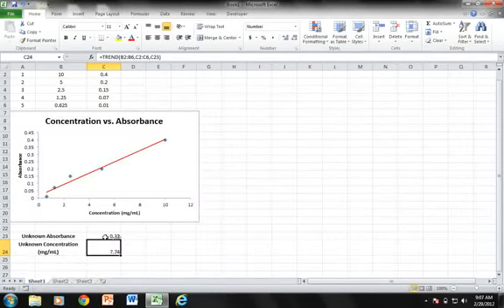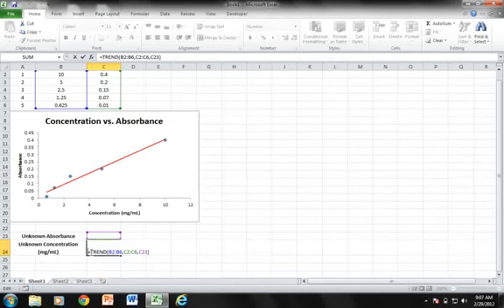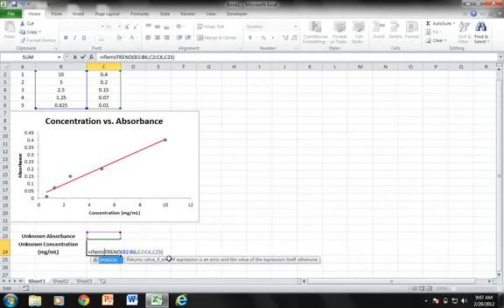Okay, so when I delete this, it gives me that value message, basically stating that there's a value missing, and that's an error. So to correct this and have it not display anything if I don't have anything inputted for my unknown, I'm going to type in a special formula called IFERROR. Basically what IFERROR says is, if this particular formula comes out with an error, what should the cell display?